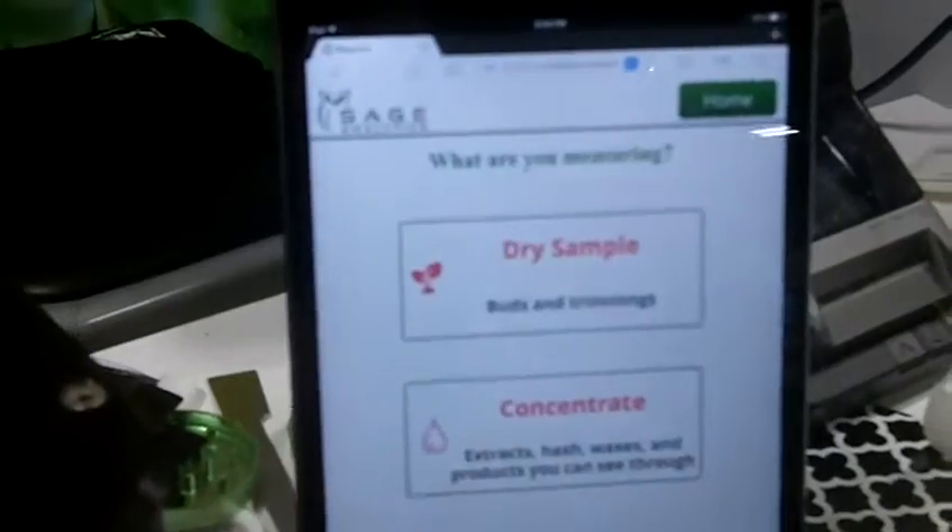Okay great, so I will show you exactly how this works. First of all, we're going to measure a sample — are we measuring a dry sample or concentrate? We're going to do a dry sample. We're going to clean the window with an alcohol wipe; we just want to make sure that we don't have any residual oils or anything that's going to interfere.